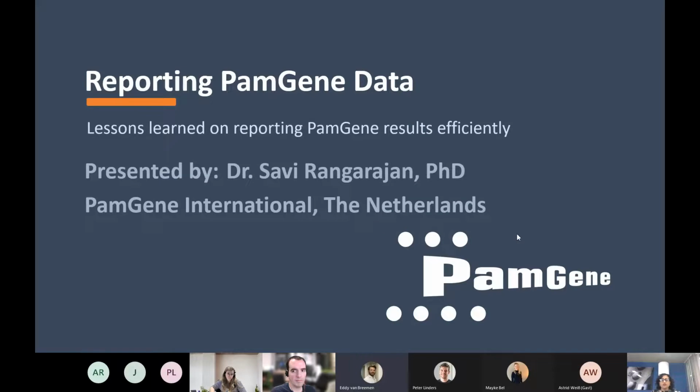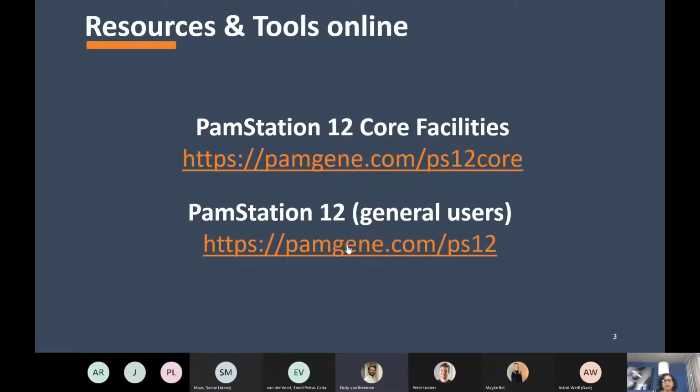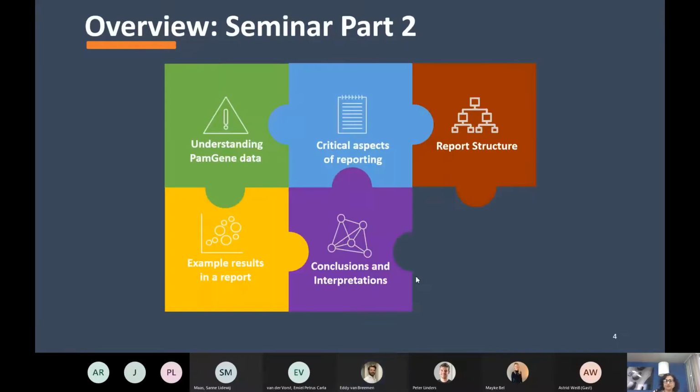So today I will share with you some of our ideas and experiences. And of course, we always love feedback from our customers also. So please feel free to let us know if there's something additional you think is important or critical in reporting, which I haven't mentioned today. So this was all the previous talk, and then today I'll continue with the reporting part. And you can find all of these materials, like these videos and presentations, at our core facility, and also additional information on the general users.